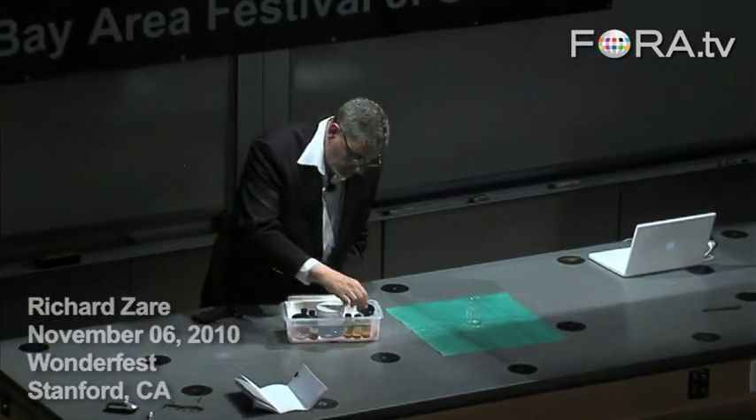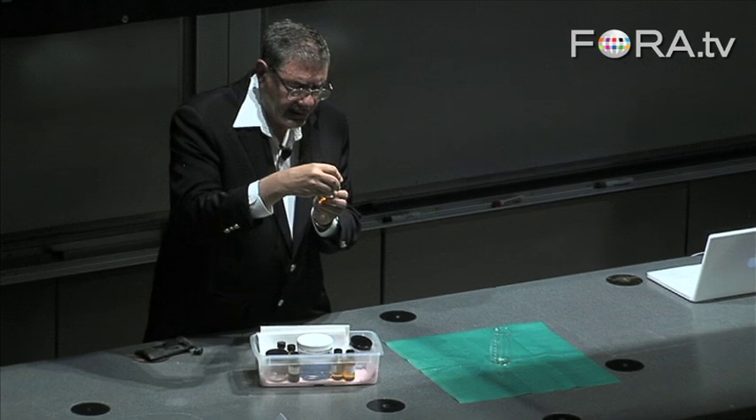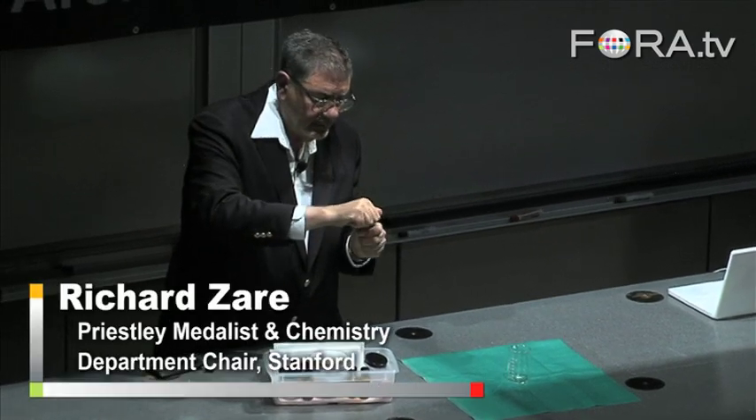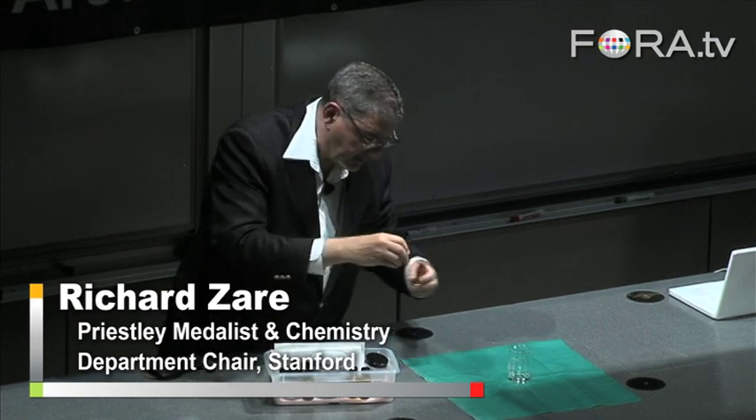This is a beaker. What do we have here? This is hexamethylenediamine. This is the stuff we want. We're going to put this, and we're going to spill some of this into the beaker.